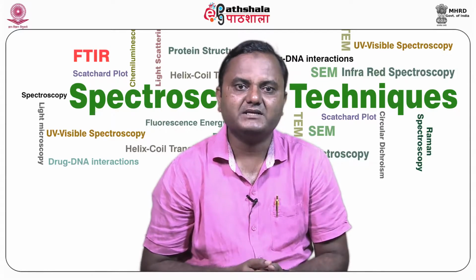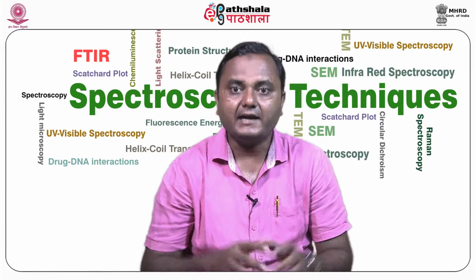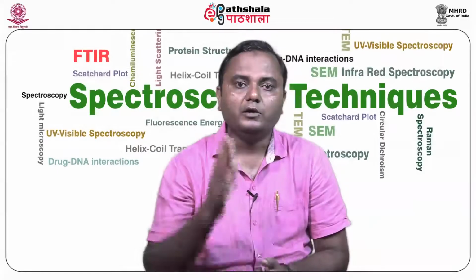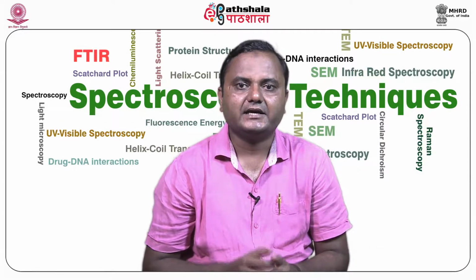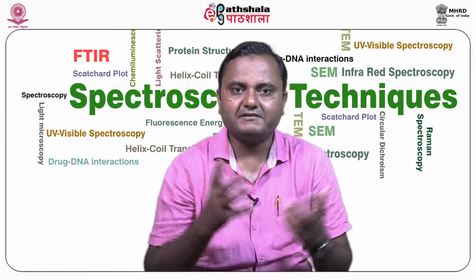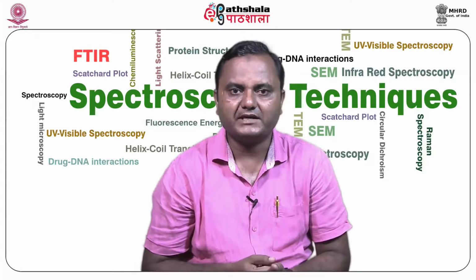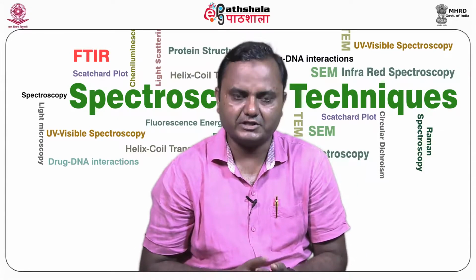However, it cannot measure the molecular weight of the anisotropic scatterers, those affected by the angular dependence. A low angle light scattering detector collects scattered light at 7 degrees. It can measure molecular weight for all molecules but has a lower signal to noise ratio.